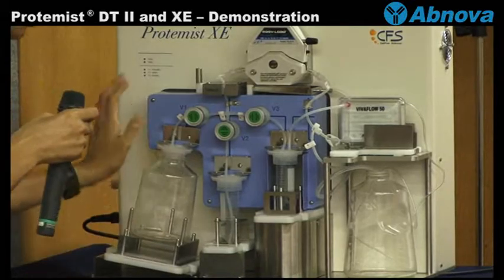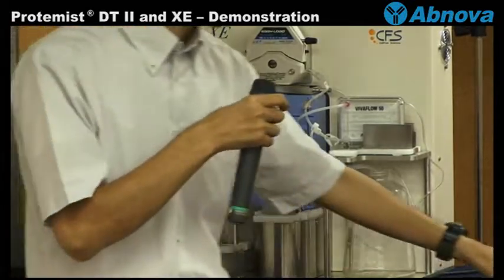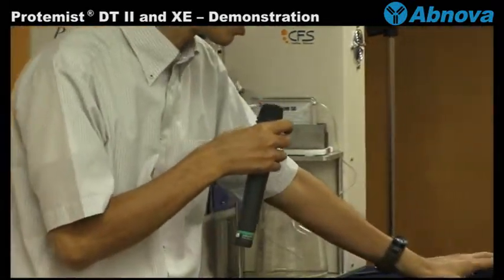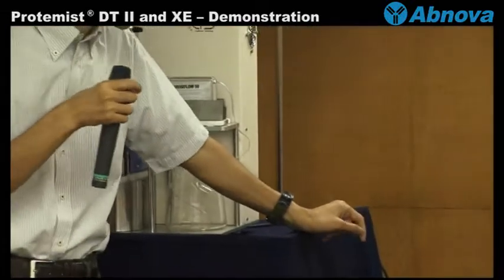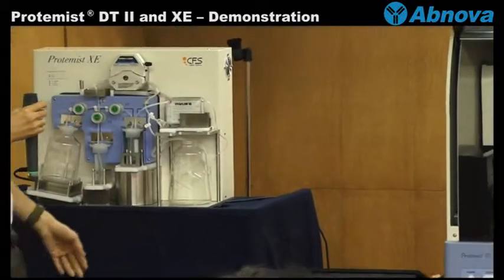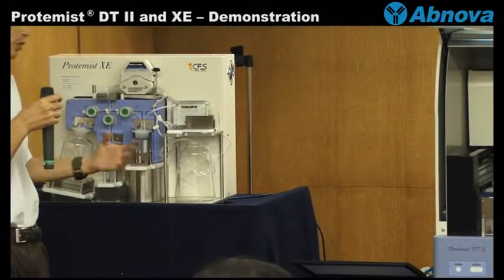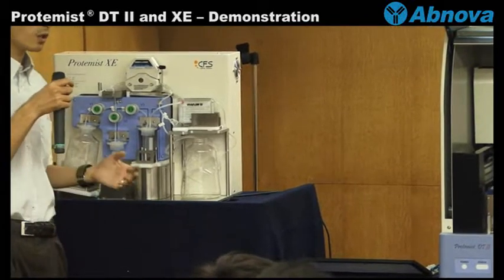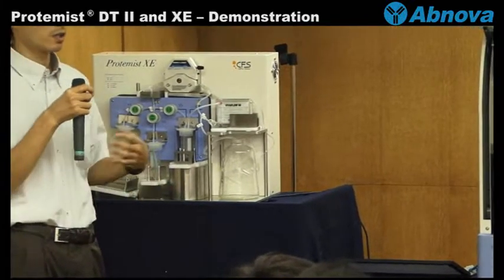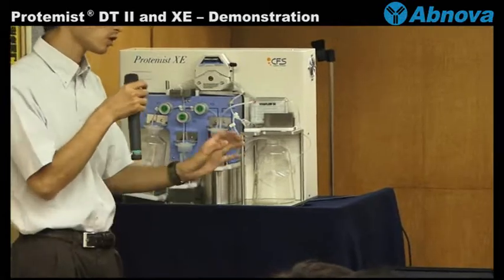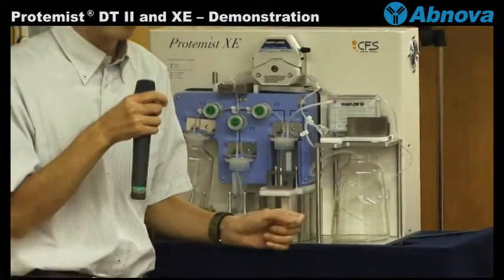And then this robot also controls through PC and has dedicated software. And we made optimized software so that basically you don't need to change each parameter. Simply choose program as you want.